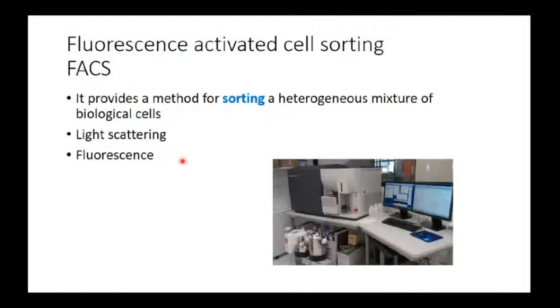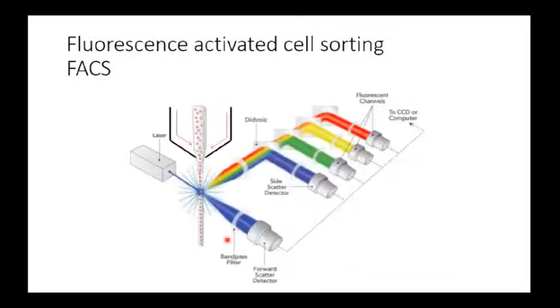FACS mechanism looks like this. So we have the machine, we have of course the computer, which is going to analyze the data, and we have the fluids container and the waste container. Now, how does it work? A FACS machine looks like this from inside.